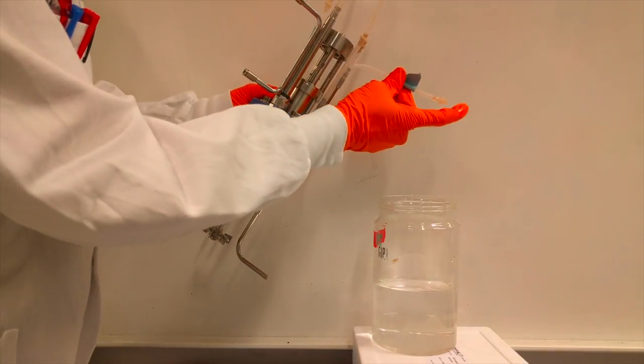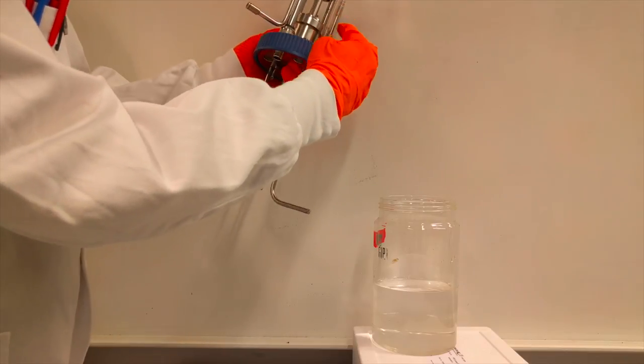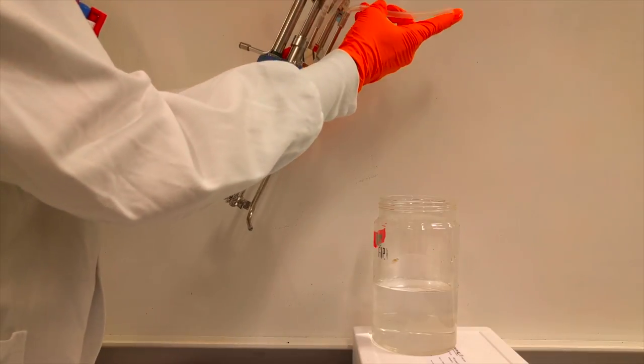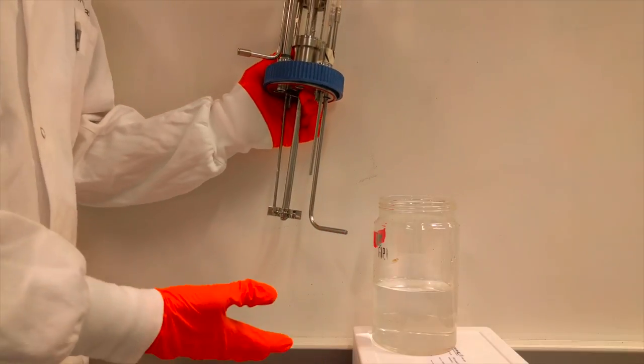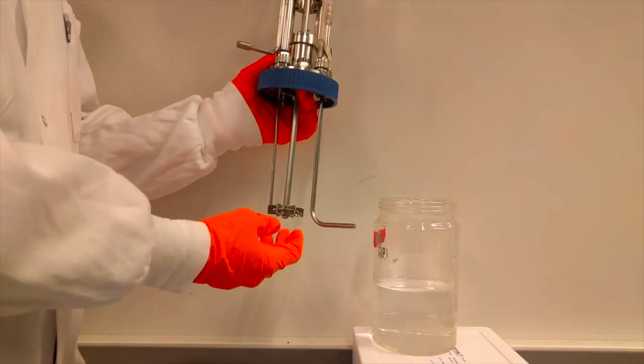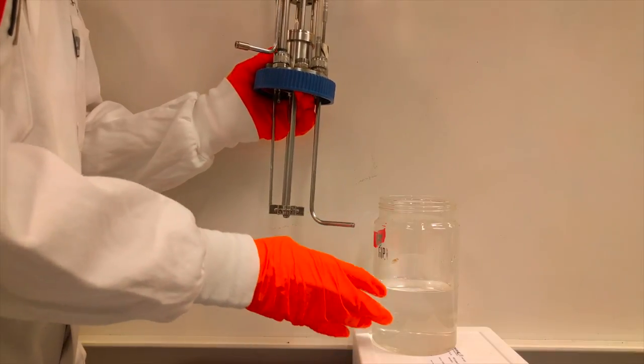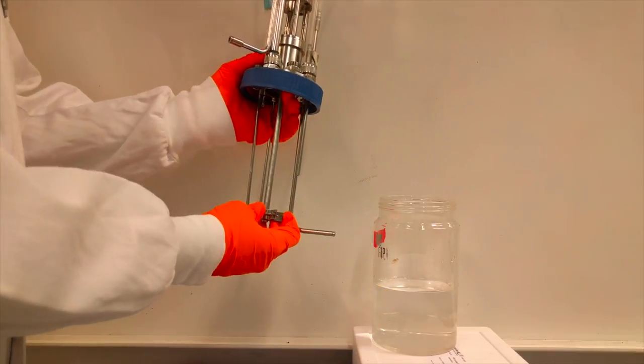So the air will actually be going out toward the bottom and it will bubble up from there. That's going to be pumped in through this tube at the top, which will go down through our sparger and allow us to aerate our chamber. And along with the impeller, that's going to give us a nice even aeration throughout our entire chamber.